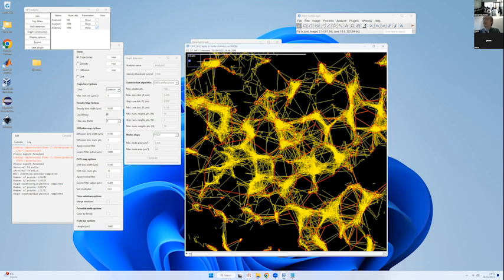You can make Python scripts that run in ImageJ, and you can access all these functions through scripting, and you can run optimization or batch and everything. And that's the way I use the plugin mostly. And then from these scripts, you can save plugin files that you can then open in the interface and look at what happens.